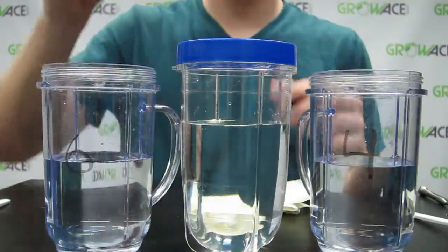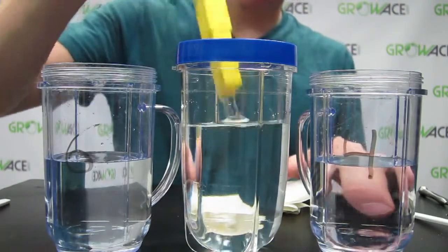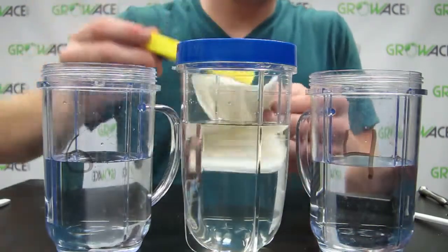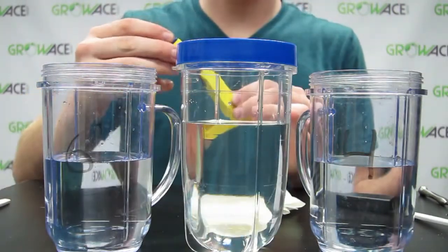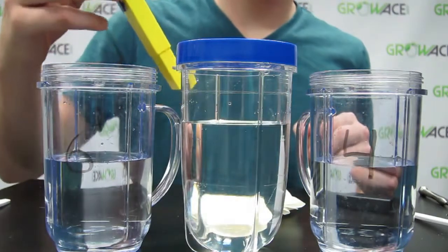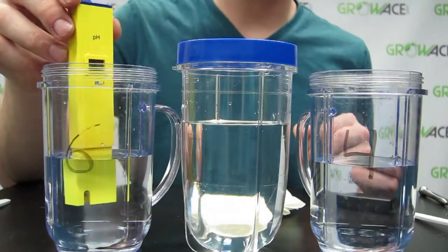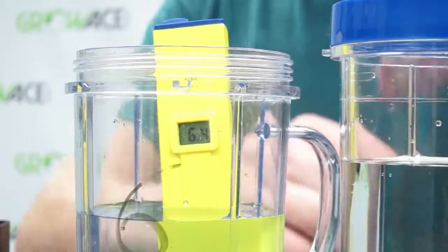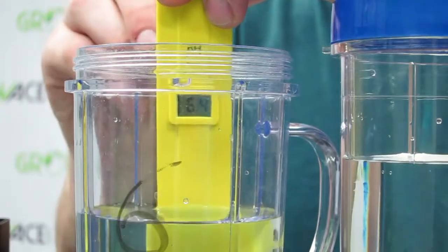Grab the pH meter, remove the cap, and gently rinse the electrode with the distilled water and dab it dry. Turn the meter on and dip it into the 6.86 pH solution. Wait for the reading to stabilize. If the meter doesn't read 6.8, take the screwdriver and set it to 6.8.